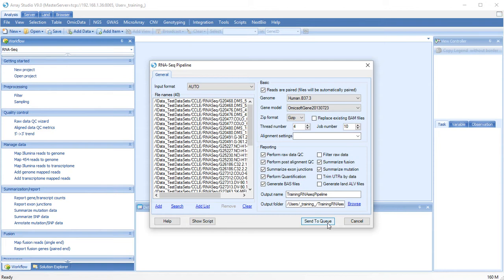This analysis can take a long time. On our servers, this analysis took overnight with 20 samples.